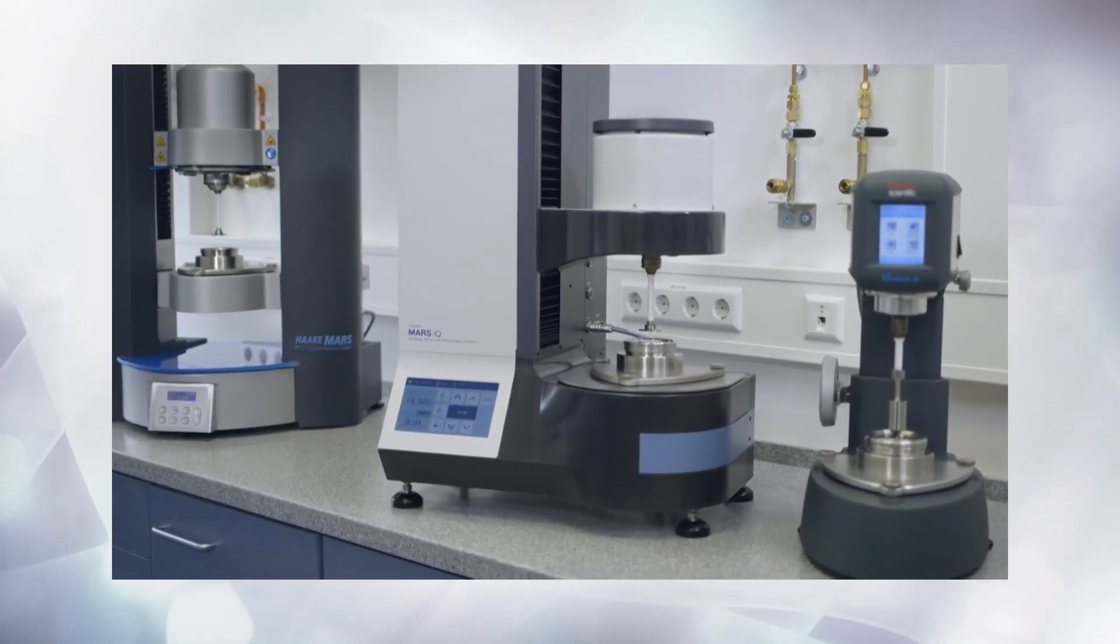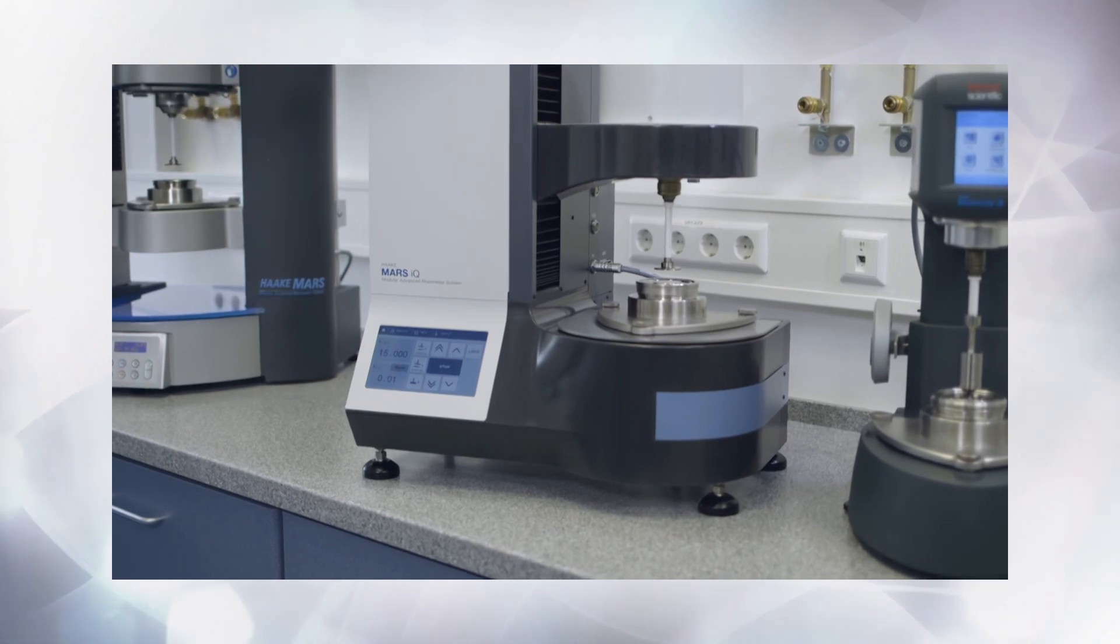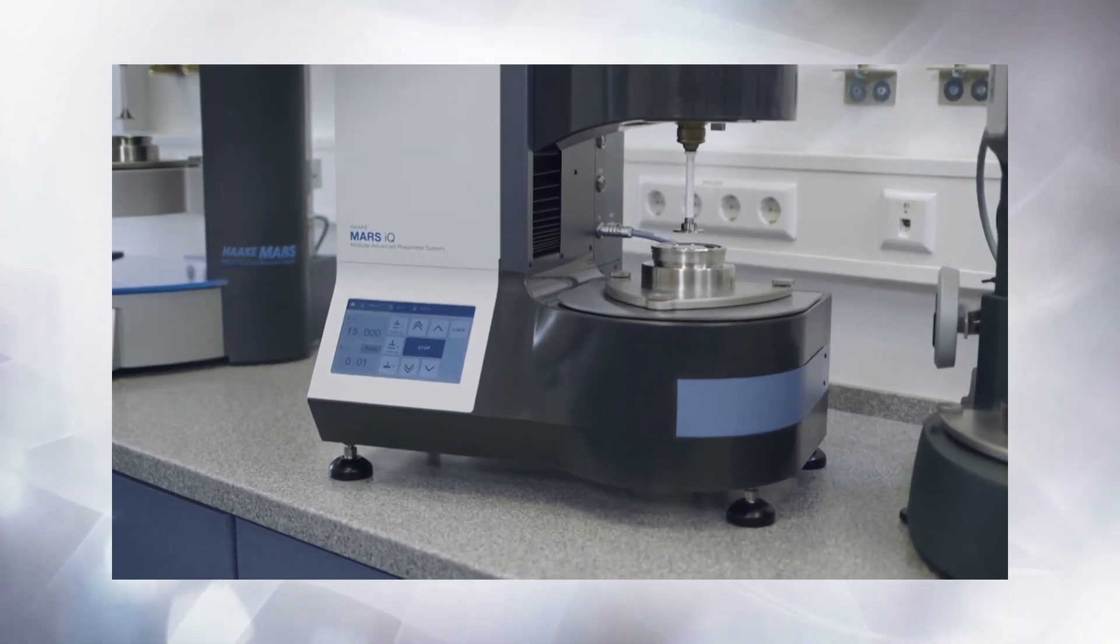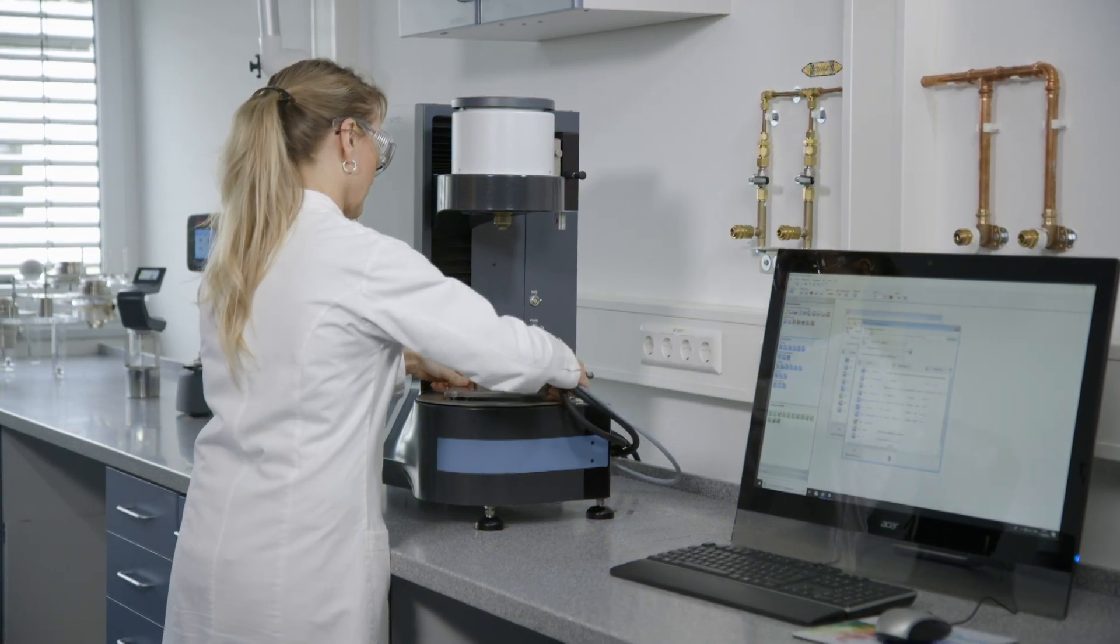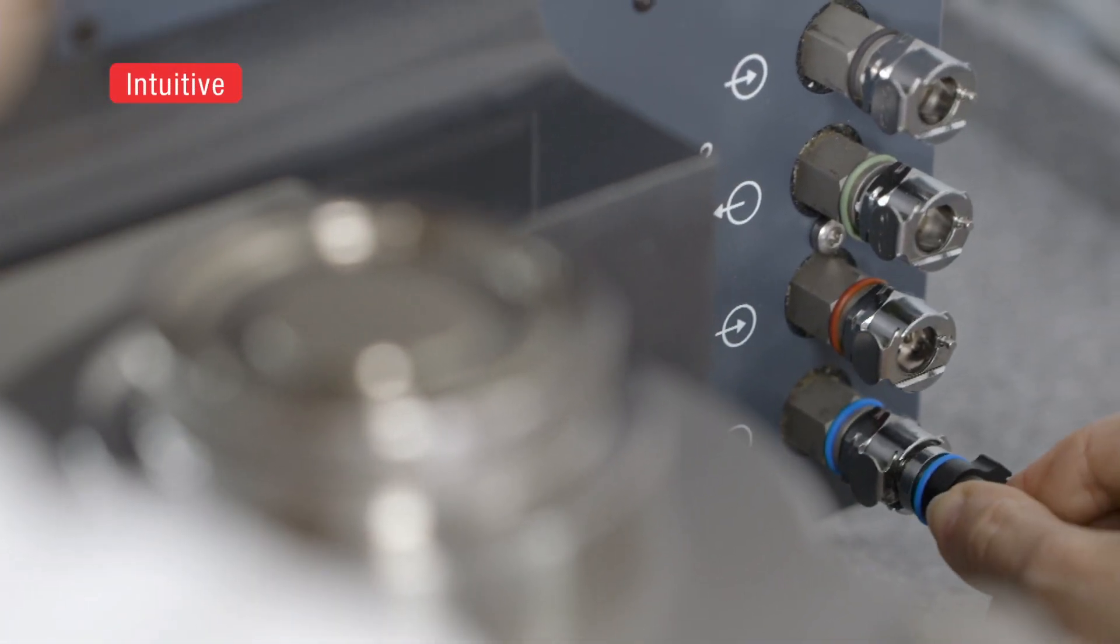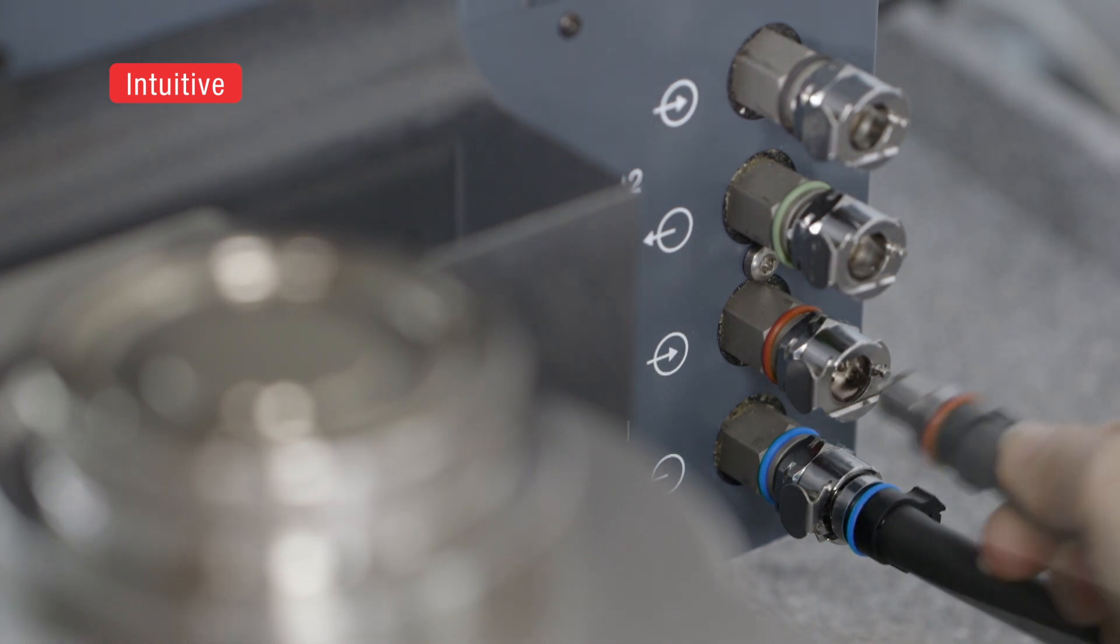The Thermo Scientific HAAKE MARS iQ Rheometer offers all that and more. Above all, it is intuitive, making QC even more convenient and reliable.